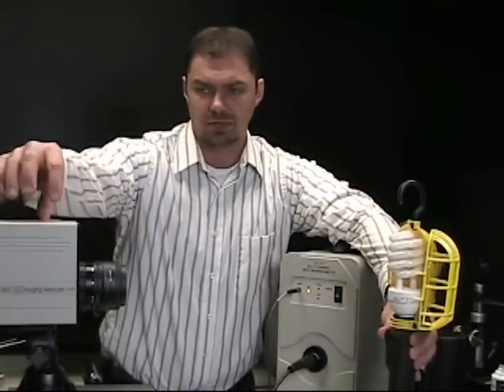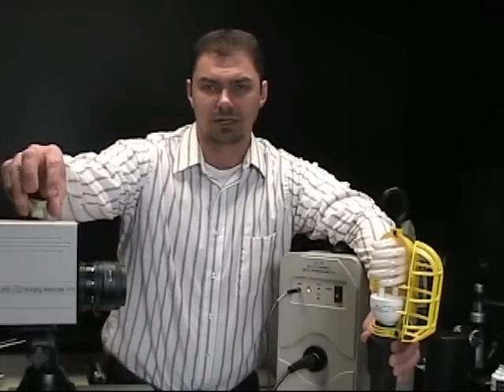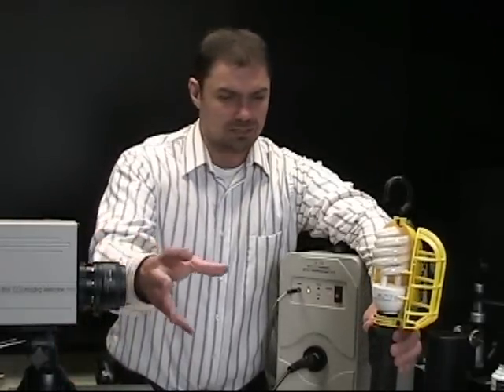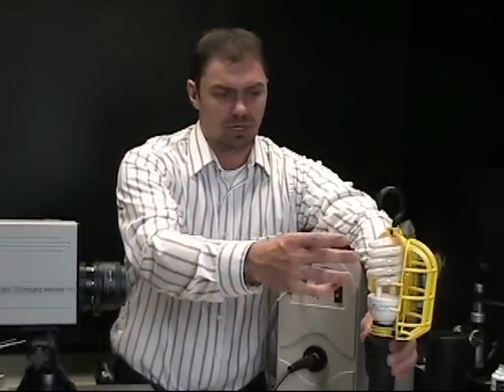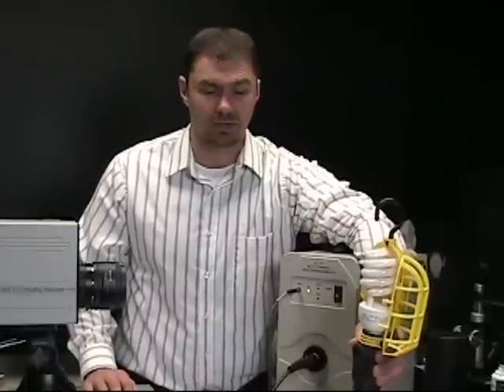You're going to be looking through a focusing optic as opposed to using a CCD imaging telescope to align it. But I'll move into the software and I'll show you some screenshots of what it would look like if you were to look through the imaging optic in the 730-9Q that you were quoted. You essentially align this, put your dot on wherever you want to measure the radiance, and move into the software.